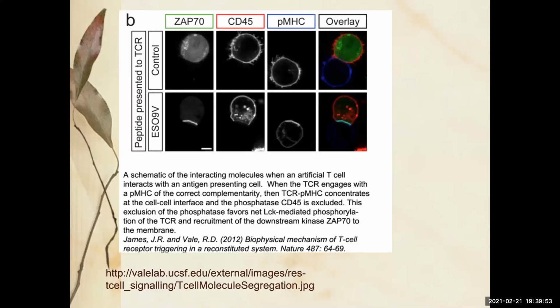And then you present an overlay, which is, I can tell that this is different than this, but it's just nice to see them together. It just gives my eye more info. But if I put them all together as black and white images, I'm not going to be able to tell what's what. So, okay, let's add the color back in. And besides, we love color, so why not? So all 4 of these images together is actually an image, okay?